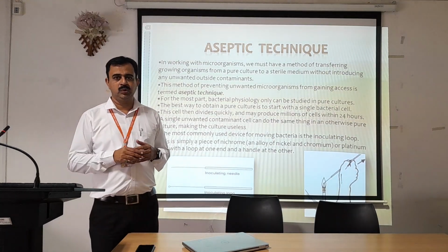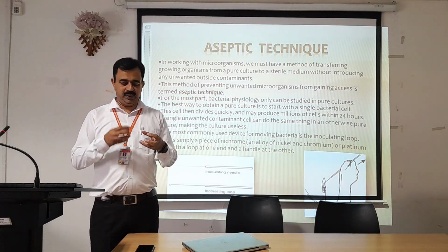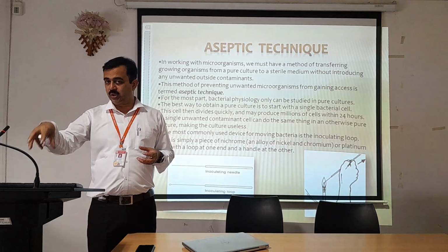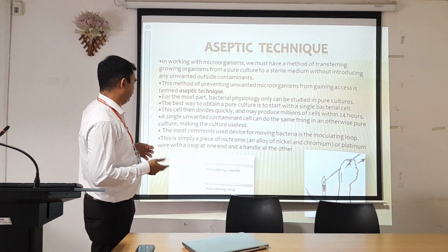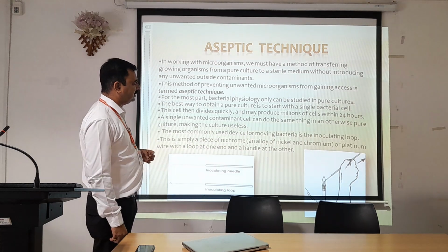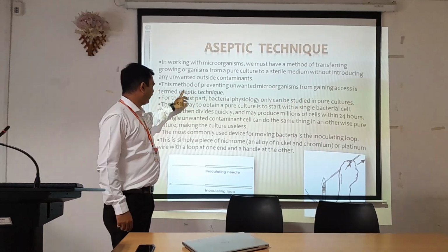While transferring, if aseptic conditions have not been maintained, it may happen that organisms in the air, or on that plate, contaminate the culture, and your results, which may have been very good, are spoiled. This method of preventing unwanted microorganisms from gaining access is termed aseptic technique.